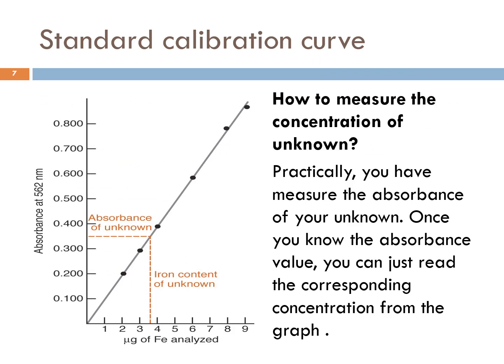Okay, this is the standard calibration curve. Okay, for example, you want to determine the concentration of the ferrum inside your sample. So you must prepare the standard solution in which you dissolve the ferrum. The ferrum which you know the concentration. Okay, ferrum ni yang commercial punya lah, yang you beli commercially. And then your unknown sample ni, contoh kata sample raw water.